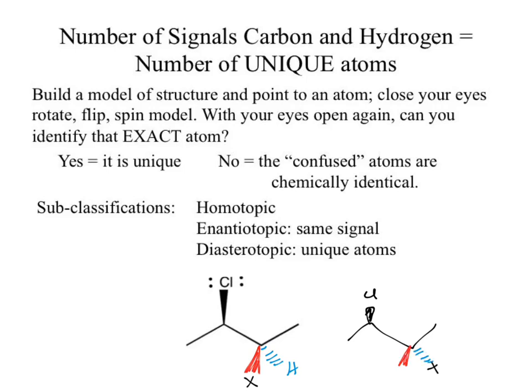What is the relationship now between those hydrogens? Those two structures are diastereomers of each other. Those hydrogens see different environments, which means different signals.